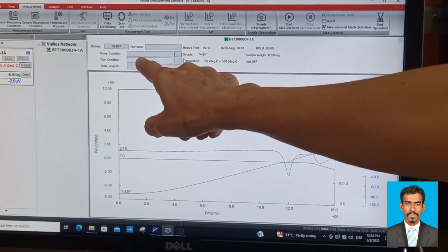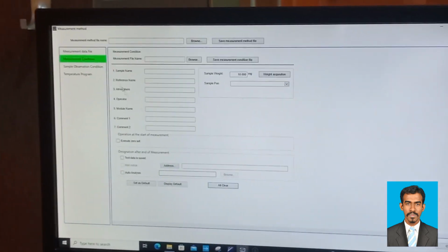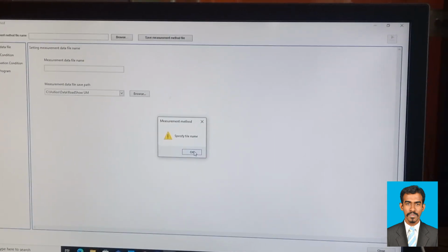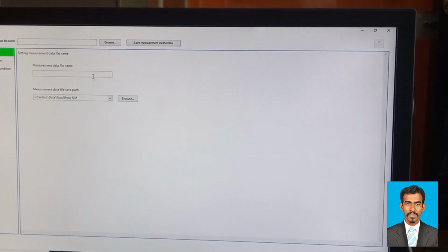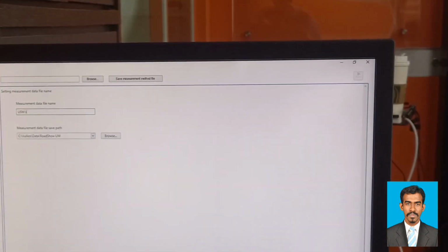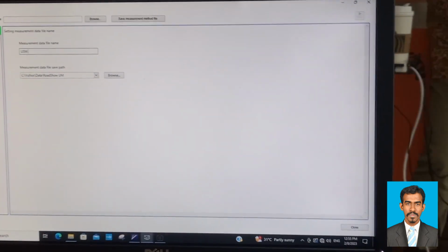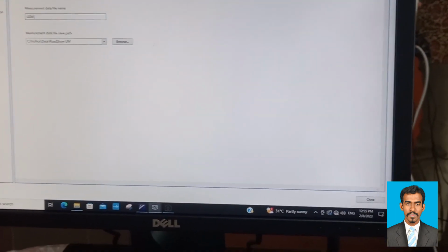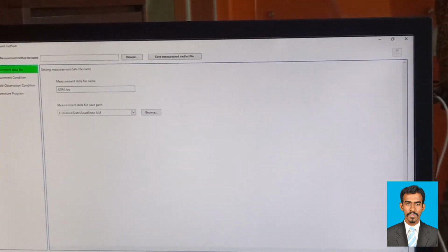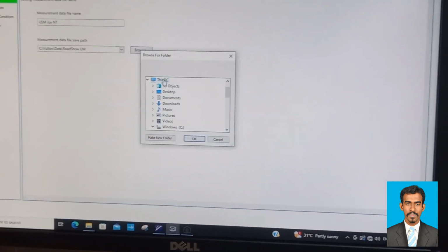To start the experiment, first we clear all the data which was previously measured and recorded so that the old data does not interfere with the new test. The instrument is equipped with a heating system that controls the heating rate and maintains a constant temperature throughout the analysis. A highly sensitive balance is used to continuously monitor the weight of the sample and reference pans. Any weight change during the experiment is recorded.